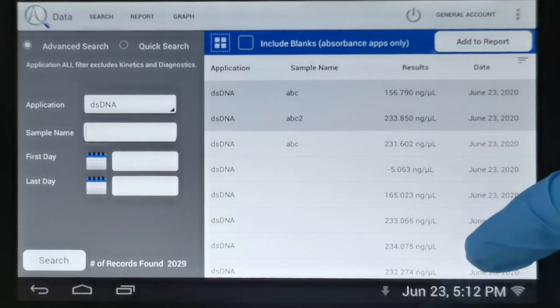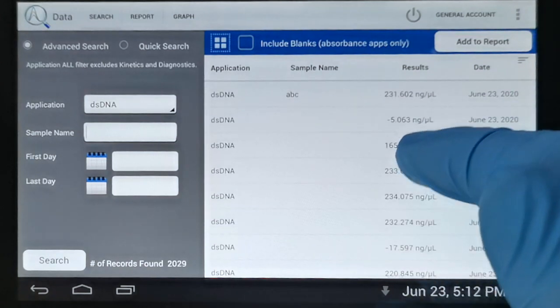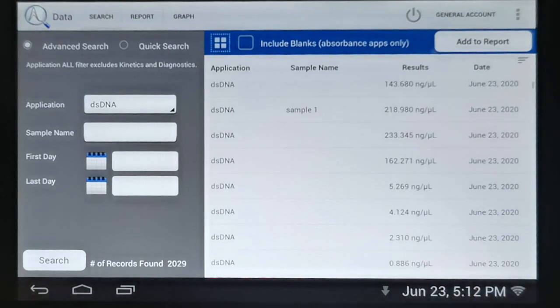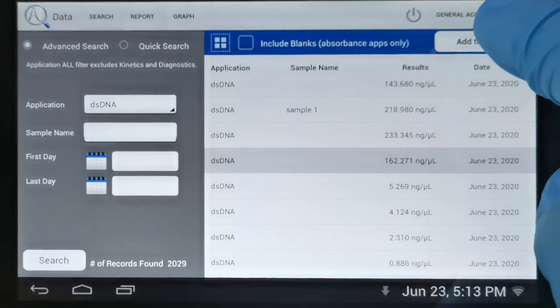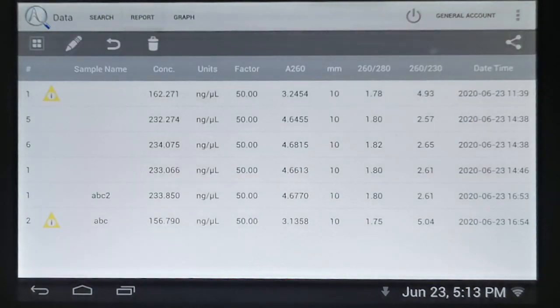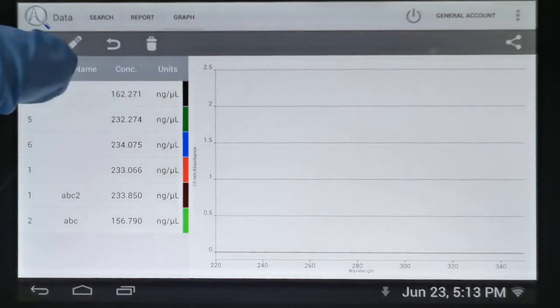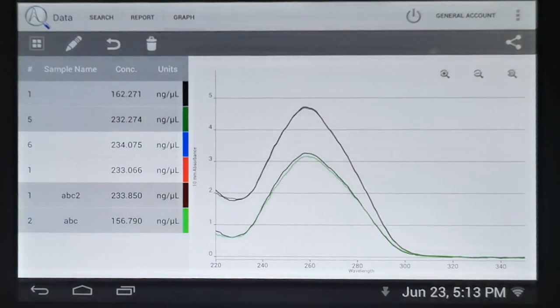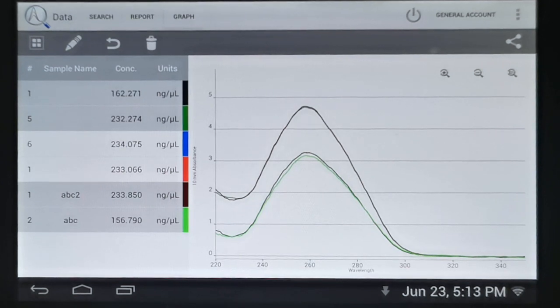We can select our recent data along with samples captured on previous days and simply add those to a report. Going to the report tab, all of that data is presented in tabular format in the same way as in the measurement apps. We can also overlay data captured across different measurement sessions in a graphical way, and export it the same way as from any of our measurement apps.